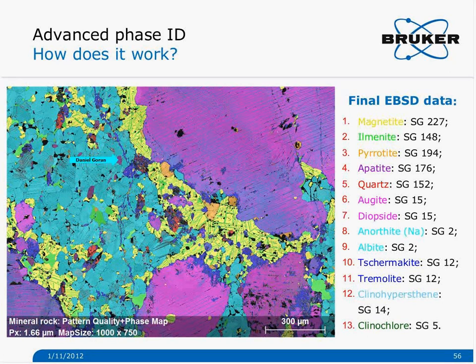So it's very helpful. And also there is quite an impressive number of different binning possibilities. Yes. Well, at least for the high resolution detector, which is strongly recommended for mineralogical applications, the detector in native resolution acquires images in 1600 by 1200 pixels, and from that you can do 2x2, 4x4, 5x5, 8x8, 10x10, 16x16, and 20x20 binning. So it's really a lot of choices.